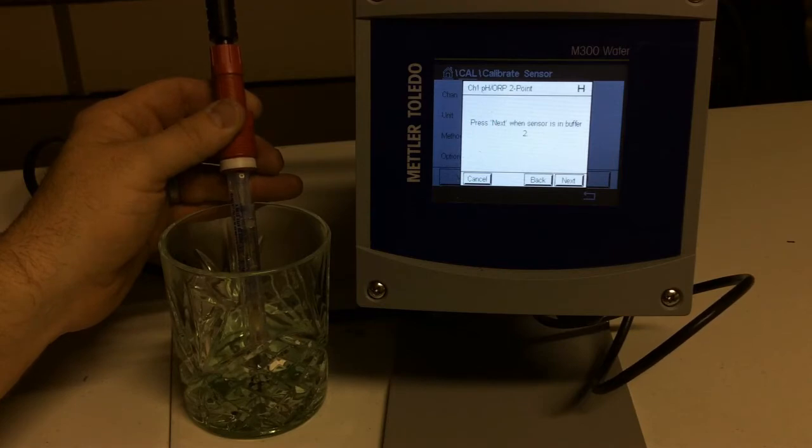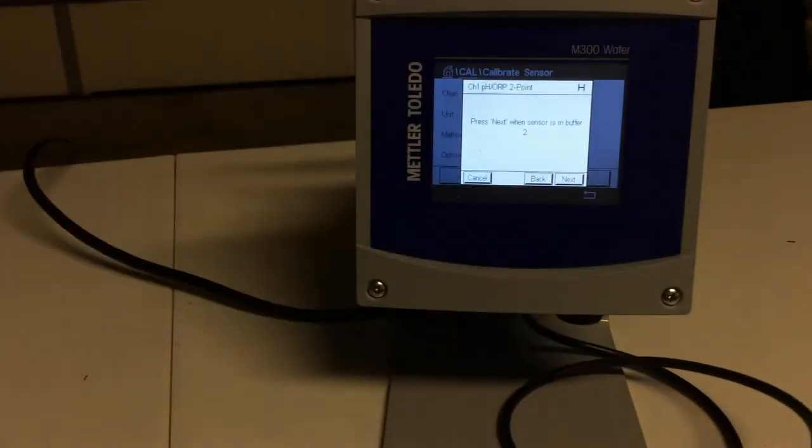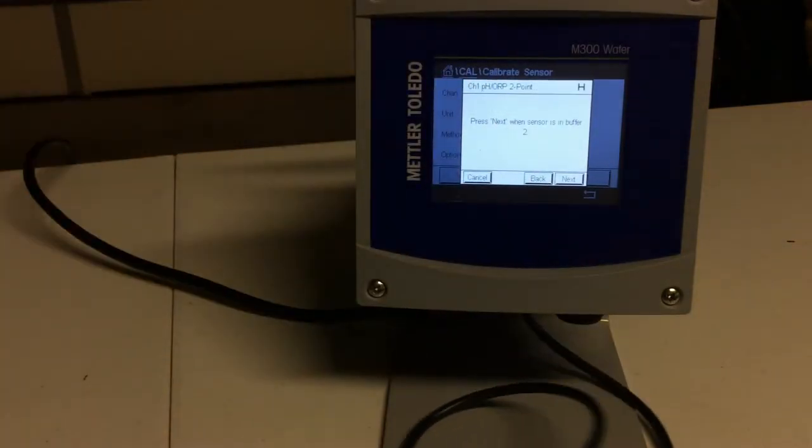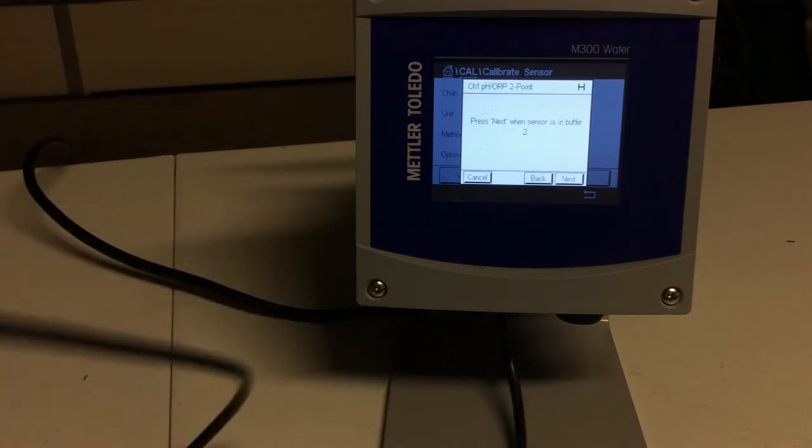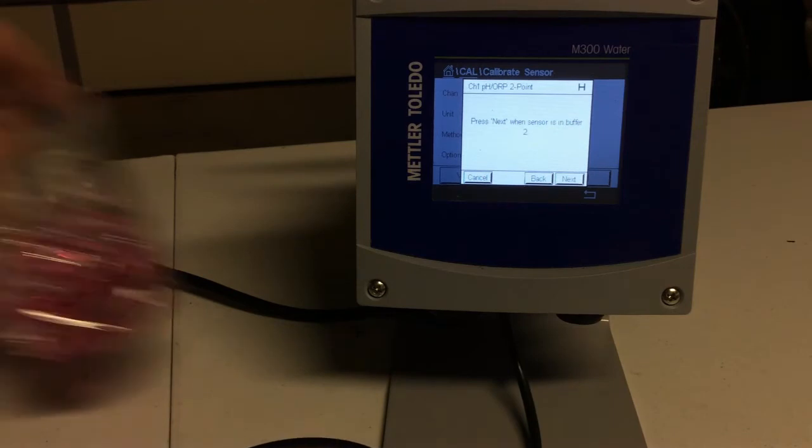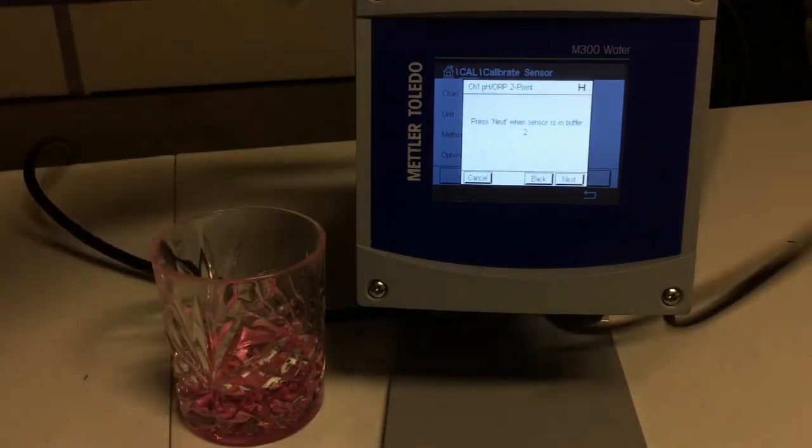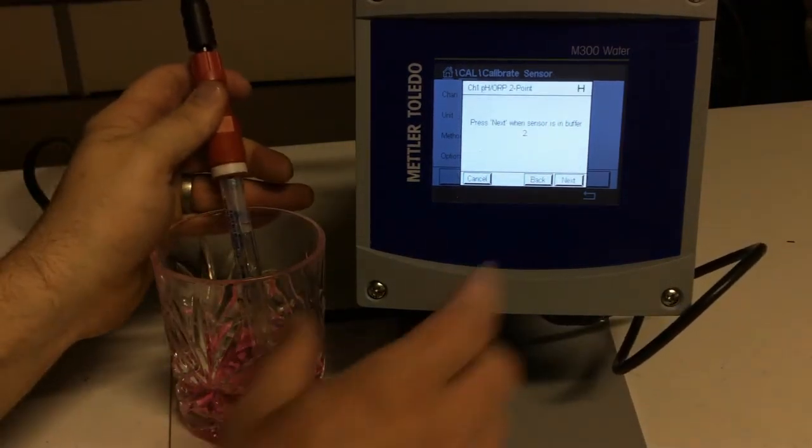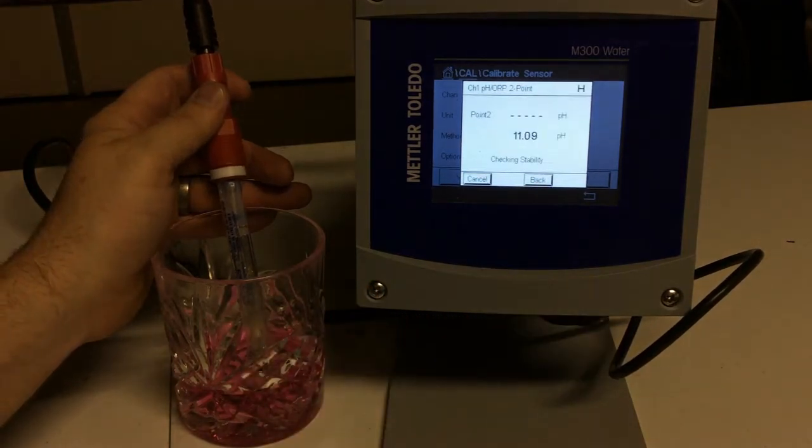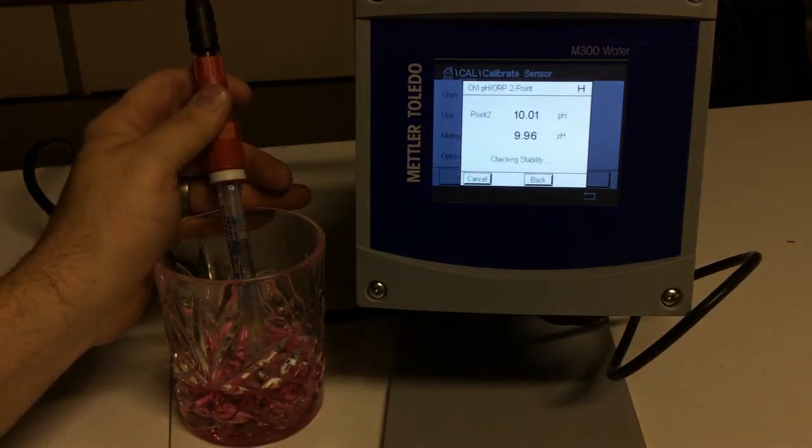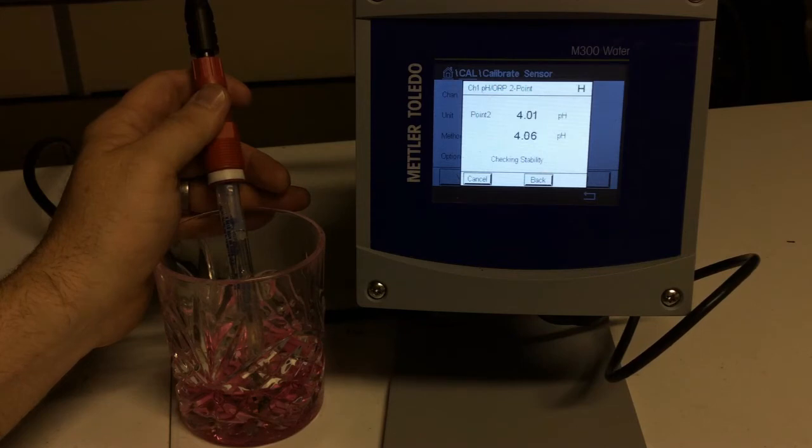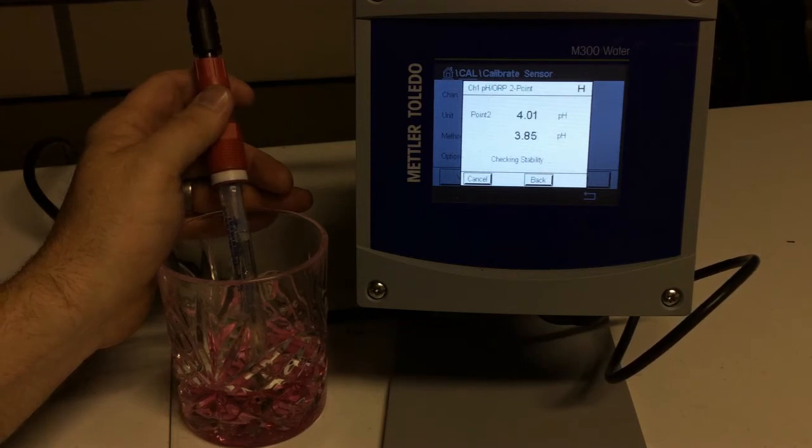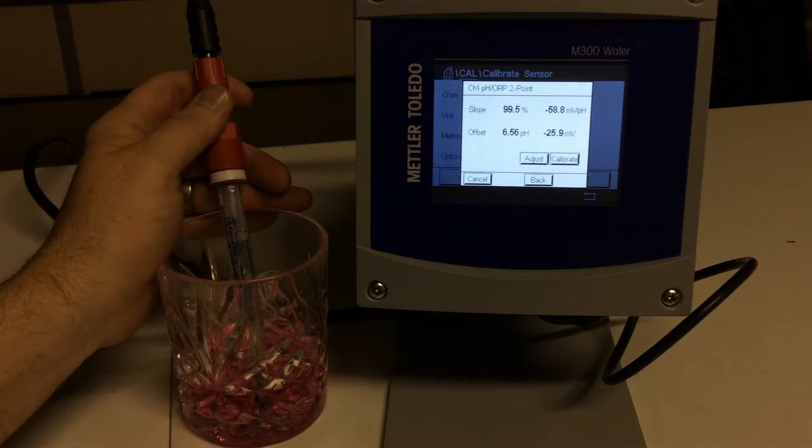So I'm going to take my sensor, I'm going to clean it off. I've got my buffer number two, I'm going to put my sensor into buffer two, and I'm going to hit next. And what I do is I'm going to calibrate to my second buffer. You can see we're still in the holding pattern. It is recognized that it is a 4 pH, and we are calibrating to our 4.